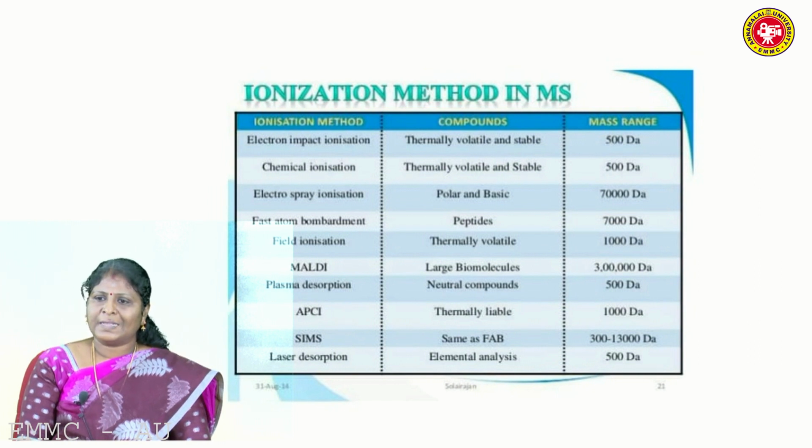Next is laser desorption ionization. Most of the techniques follow the laser desorption method. MALDI and SELDI also involve laser desorption. This is used for the elemental analysis of compounds having 500 Dalton.